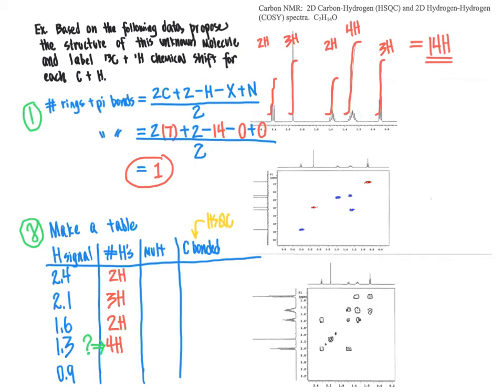So I'm putting a question mark on that; we need to keep an open mind about what's going on there, that is a bit confusing because of the fact that 4 hydrogens can't be bonded to a single carbon atom. So we'll evaluate that in a moment.